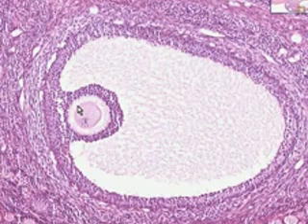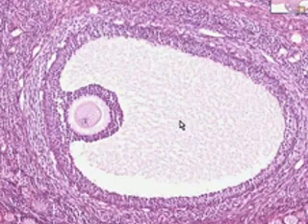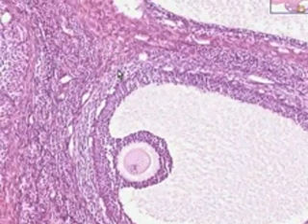This may be some remnant of a zona pellucida. Here you have the granulosa cells surrounding the ovum, and here you have the granulosa cells surrounding the follicle, and this large space in between is liquor folliculi. Needless to say, most of these spindly cells between follicles can be called stromal cells.